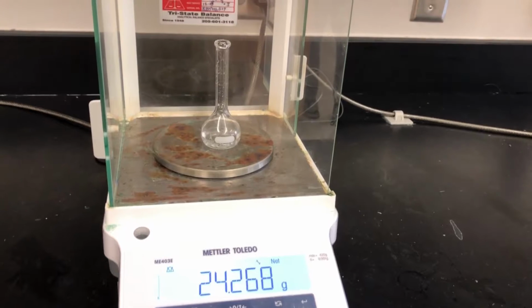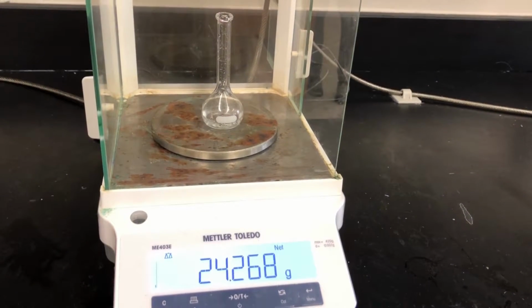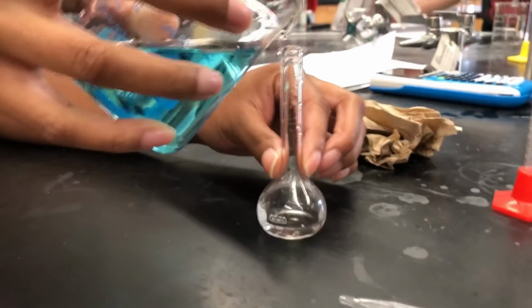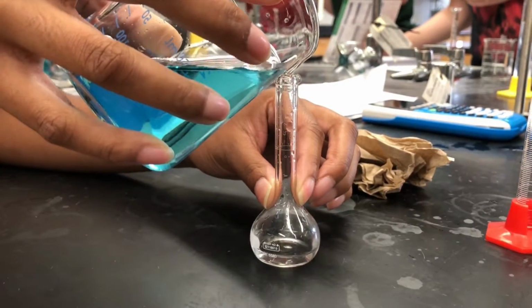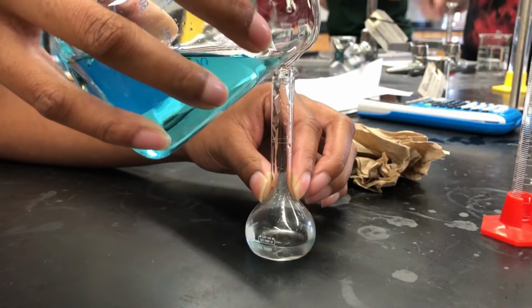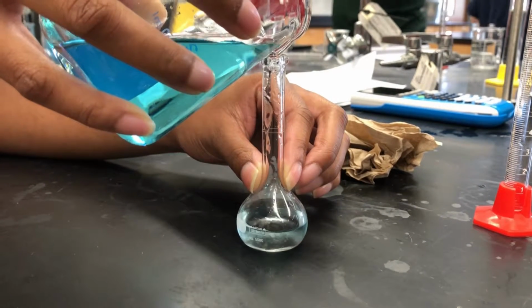The mass of the volumetric flask and the stock solution is then measured, which was 24.268 grams for this particular trial. The stock solution is then diluted, or filled to the 25 milliliter mark with water, lessening the concentration of the stock solution. The difference between the stock solution and a diluted solution is that a stock solution is a concentrated solution, which is then usually diluted with water to lessen the concentration, creating a diluted solution.